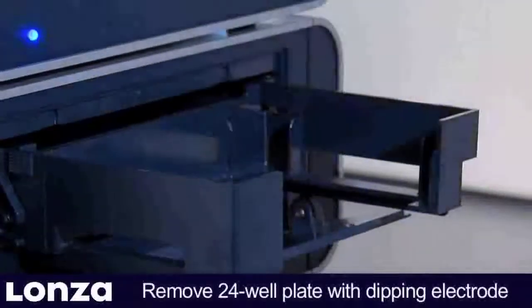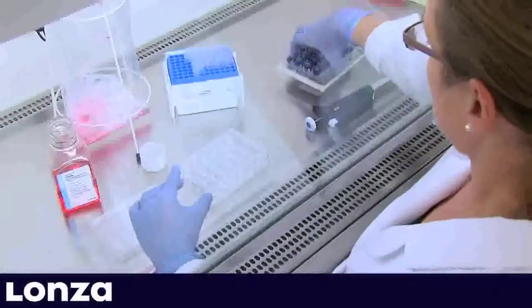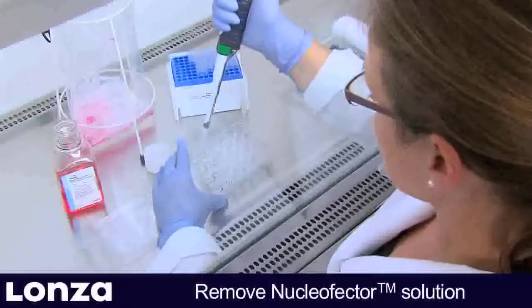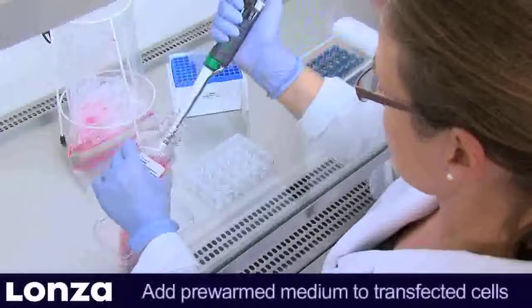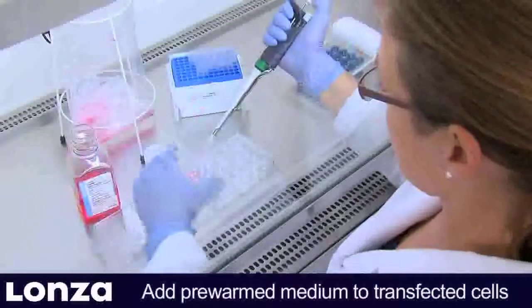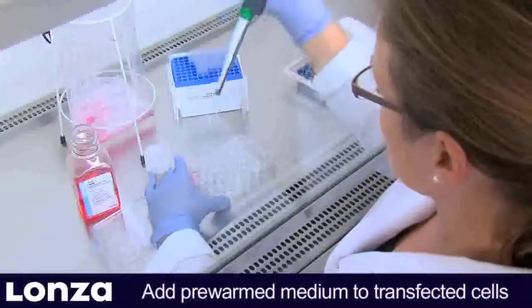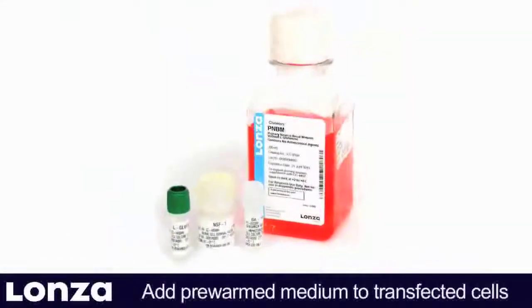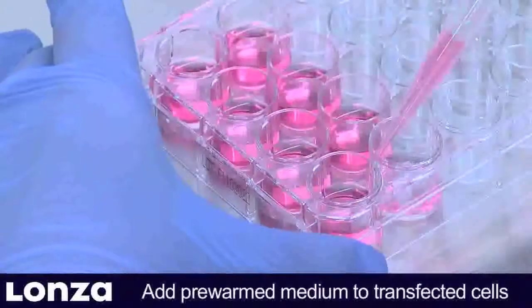Take out the 24-well plate and carefully remove the dipping electrode without spilling liquid between the wells. Then remove the Nucleaffector solution by pipetting and add pre-warmed culture medium to each well. Handle each well individually. For cultivation of neurons, we recommend using the supplemented PNBM medium from Alonza, which has been optimized for neuronal cultures.